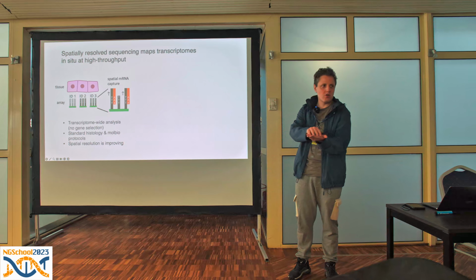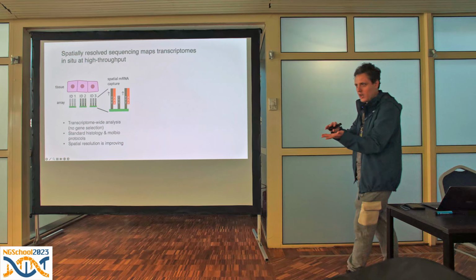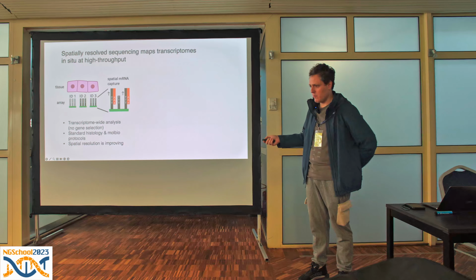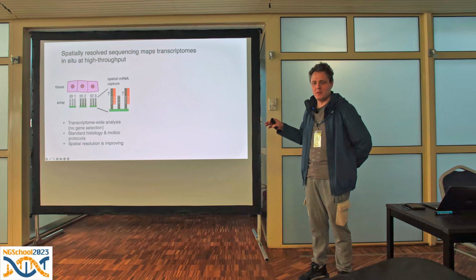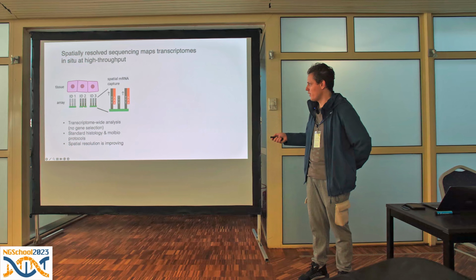To that tissue, you apply certain enzymes to enable RNA dissociation, and then RNA can dissociate and diffuse towards the slide. I don't remember all of the exact steps of the protocol. You can read them. 10x generally has very good documentation of experimental steps, with pictures. The main point is that you detect RNA by directly capturing RNA at spatially distinct positions.